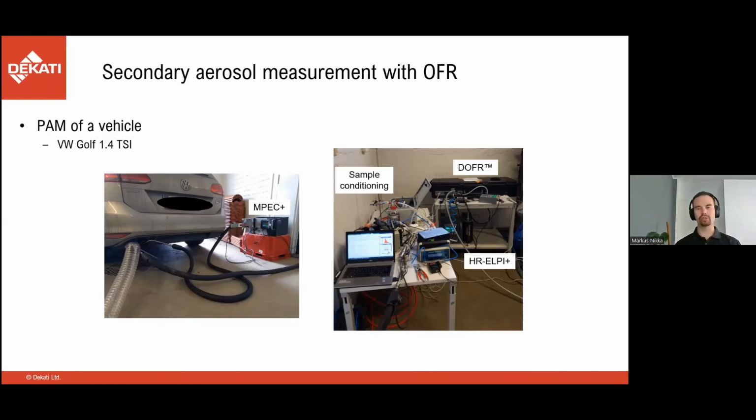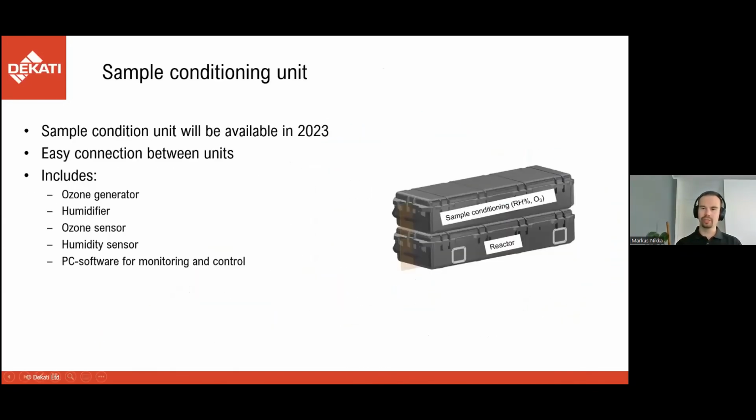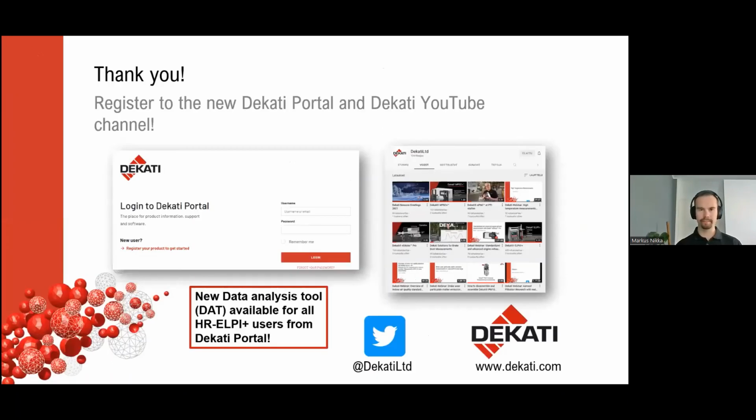There are also connectors where you can use a multimeter to measure the voltage from the UVC sensor. But with the sample conditioning unit and the PC software, the value from the UVC sensor will be available in the software.